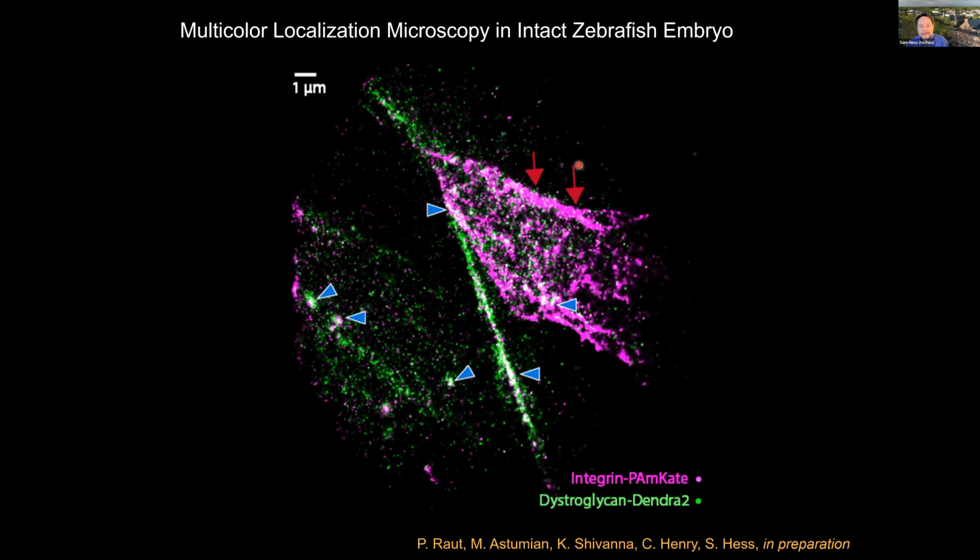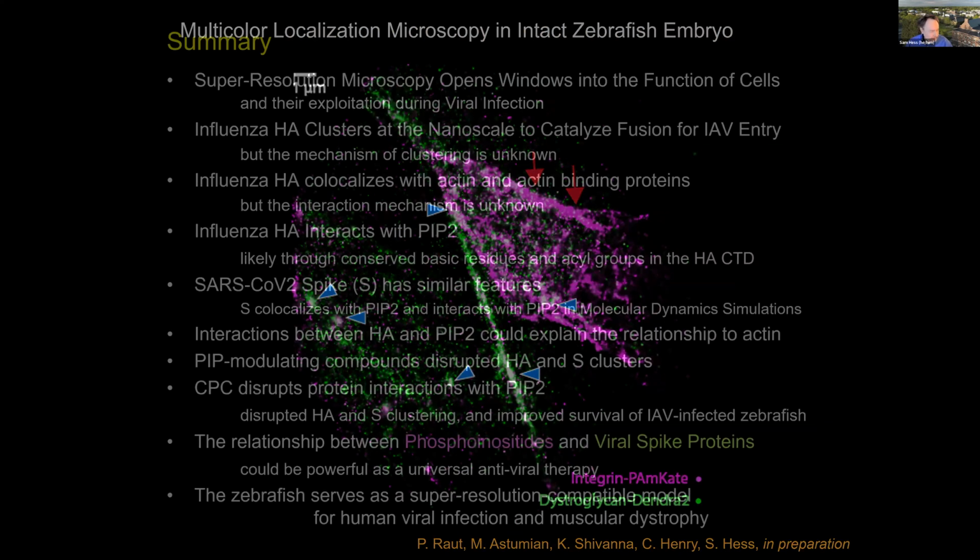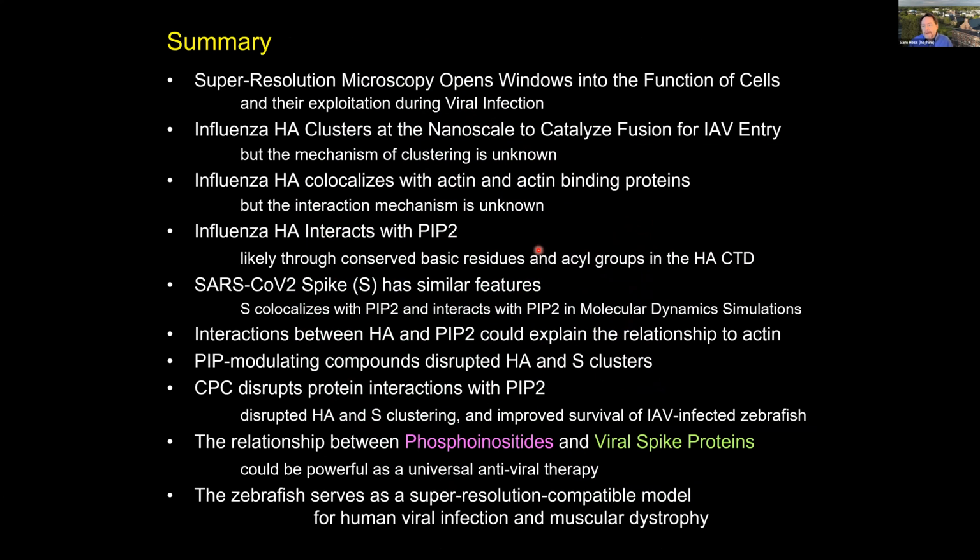Not to leave out the capability of multicolor as well in the zebrafish, which allows the visualization of intermolecular interactions that are typically very important in disease. So in summary, super resolution microscopy was developed in the late 2000s. I was very lucky to be involved in the early development of localization microscopy. And it was really because of my desire to study viruses that I pushed, and I had the need for it, and an immediate biological application once we got it to work.